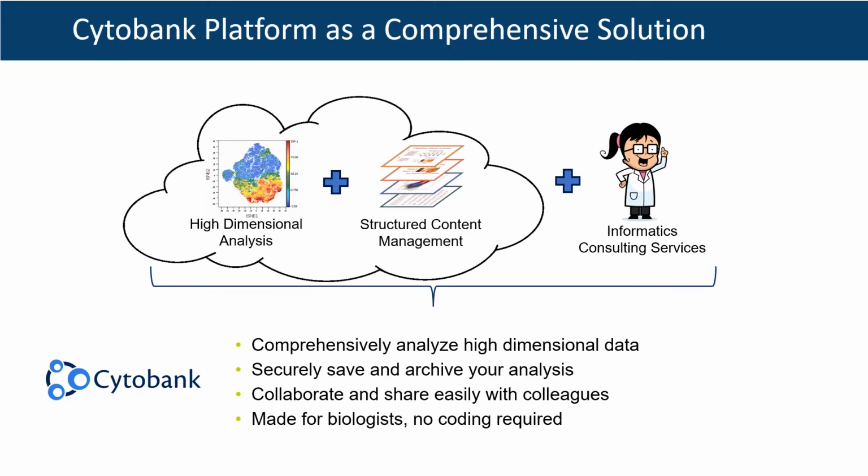So then in addition to that, we also have an informatics consulting service. So those are a couple data scientists that we have on staff here, and they have the background that's necessary to be part of your data analysis and to fill in that gap. So certain institutions will have access to informatics consulting groups, but they're going to have an extremely genomics heavy background. They're not going to necessarily understand the biology and the science behind what's driving the analysis that you're trying to do.